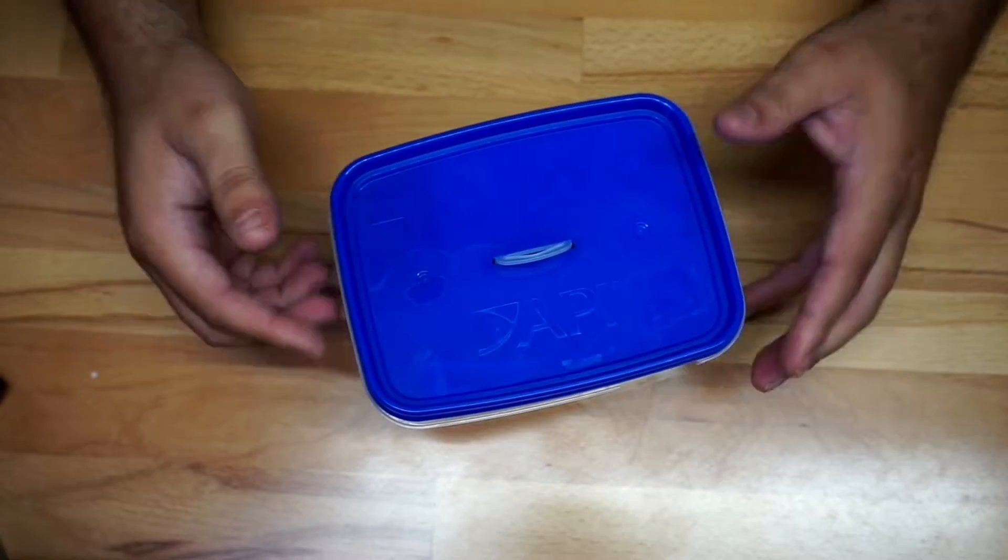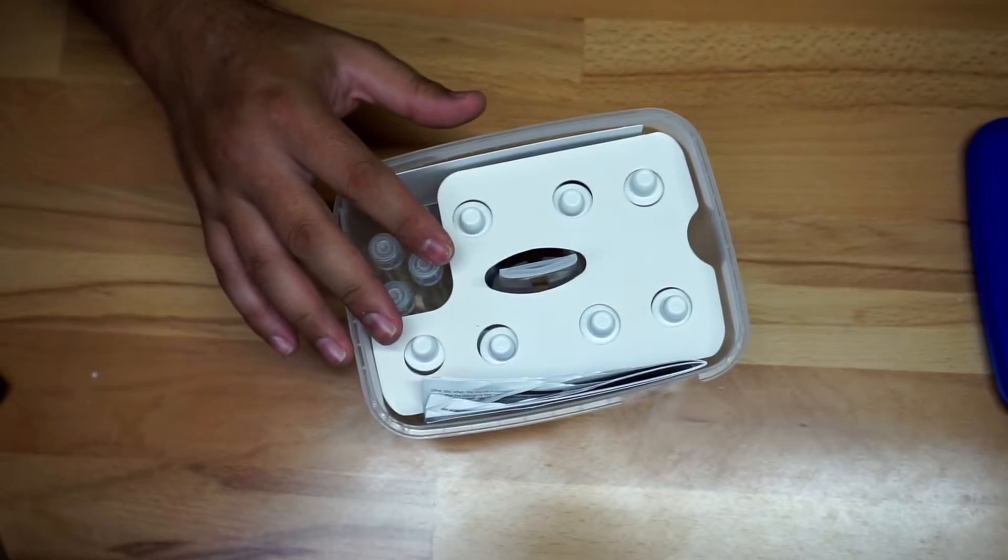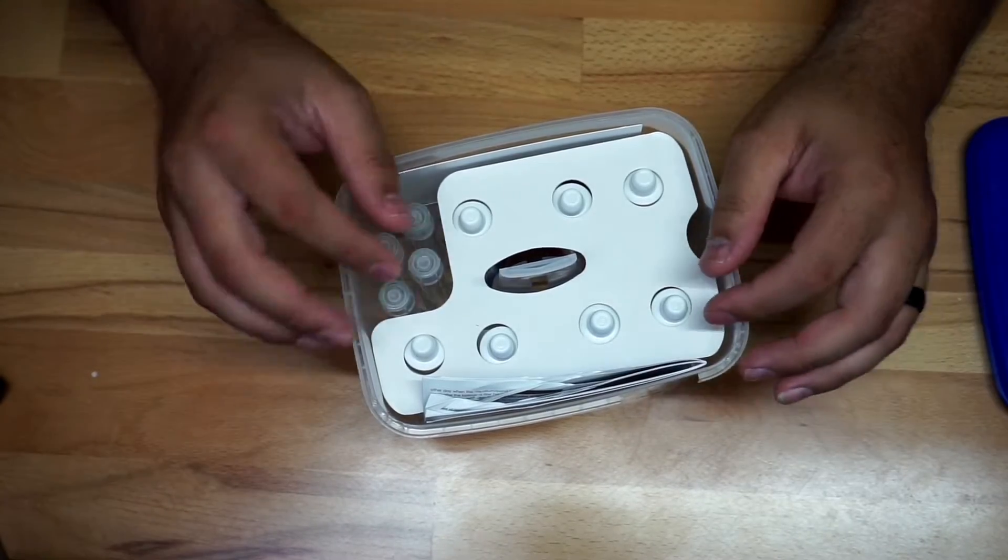So I'm going to open it up just to give you a quick idea. Again, this is going to be the freshwater master kit test and it's definitely going to last you for a long time.